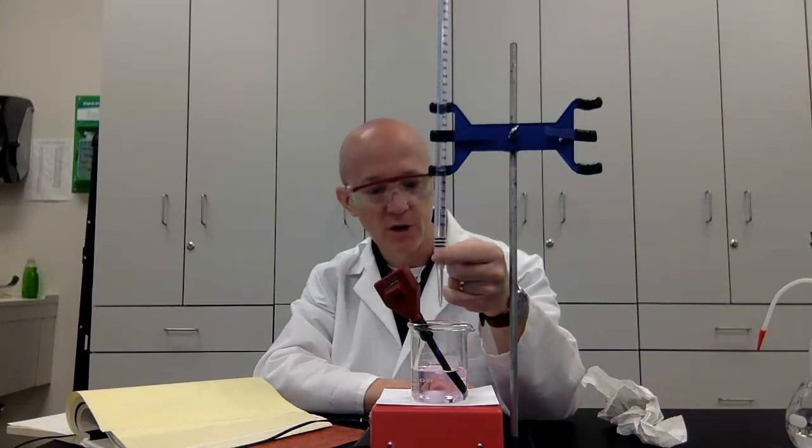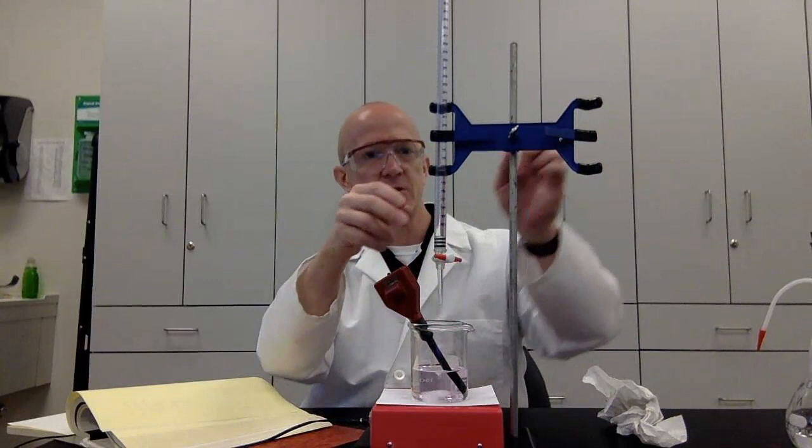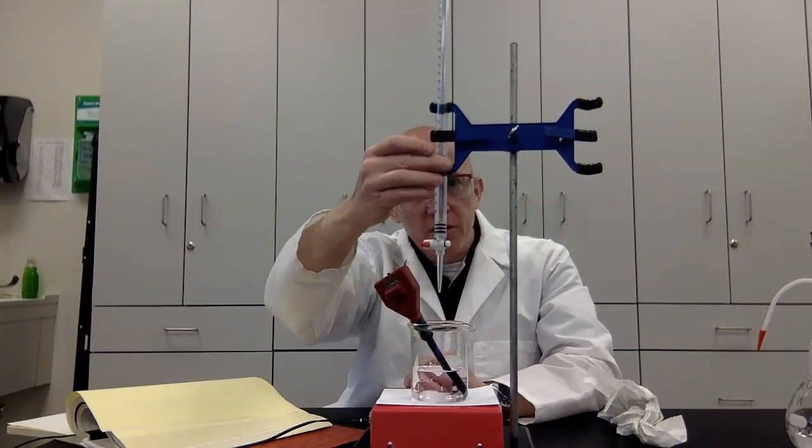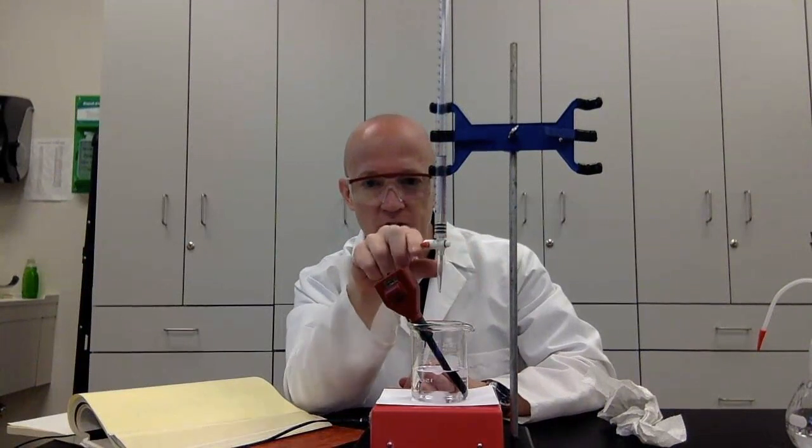You see a little bit more now? That's a pretty good place. I'm going to take that reading. I'm going to take the reading where I am as far as my volume is concerned, and I'm going to call that my volume. But then, you know what? I'm going to add a little more so you can see the pink color a little better, okay? But first, 43.30. So I'll write that down. So I've got my volume. Now I'll let you see the pink a little bit more.